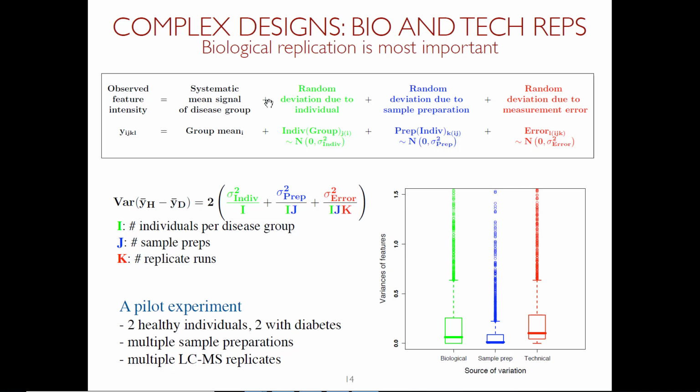And we wanted to understand what contributes to the variation most. Of course there's a difference between the subjects due to the disease. Then there's just biological variation of the subjects. There may be some variation due to the glycocapture. And then there was just some random technological variation due to mass spectrometry runs. It was a very long time ago, when we didn't quite know yet what's the right way to do this. The enrichment technology was new then, so we felt we had to evaluate the contribution of all of the sources of variation to the overall conclusions.